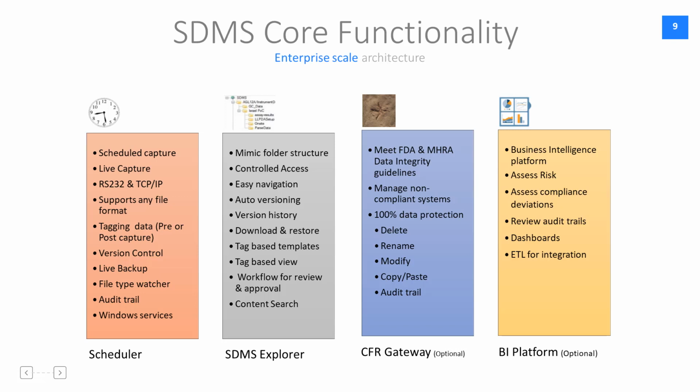SDMS Explorer is one of the most used functionalities by end users. This area is similar to Windows Explorer, so anybody who uses Windows will be able to appreciate using the SDMS Explorer. SDMS Explorer will display the file content inside the SDMS server.